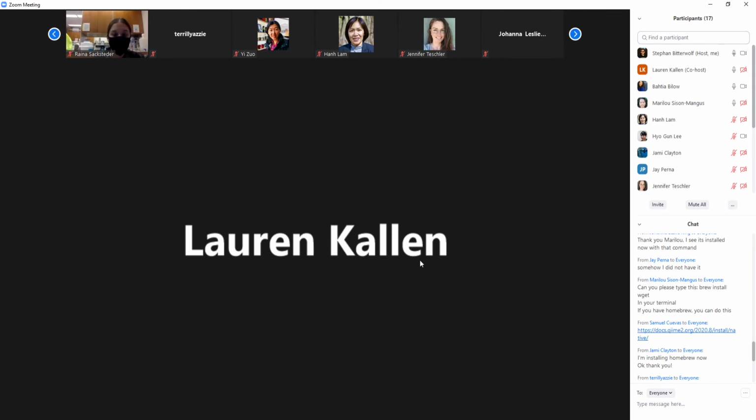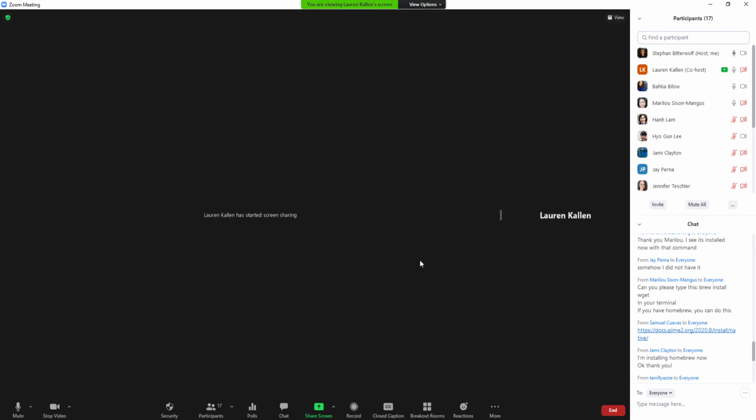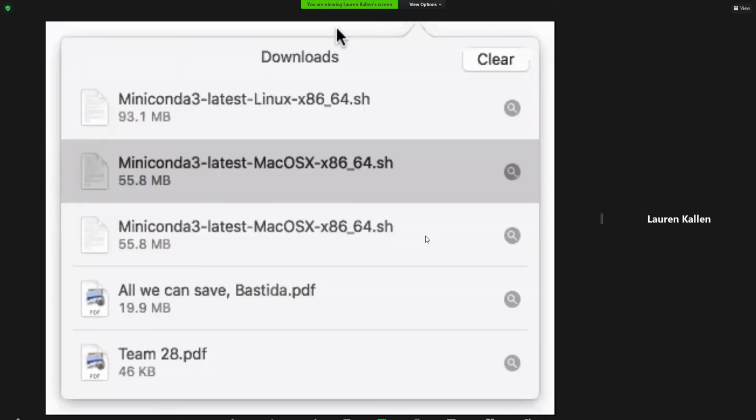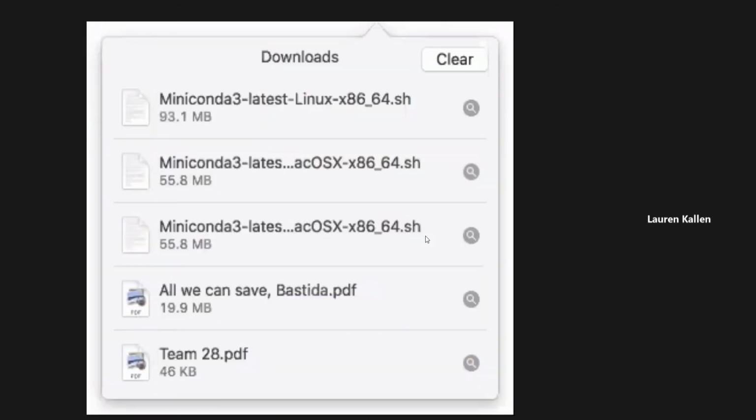I think it makes sense to just share your desktop screen if there's nothing too sensitive on there. No, that's fine. Okay, so you downloaded it manually. Got it. Is that not right? Why don't we try doing it in the terminal, because it'll be only a two-button operation. Okay, where is the terminal? Share your whole screen if you can. We're seeing a little clipping of what you downloaded.